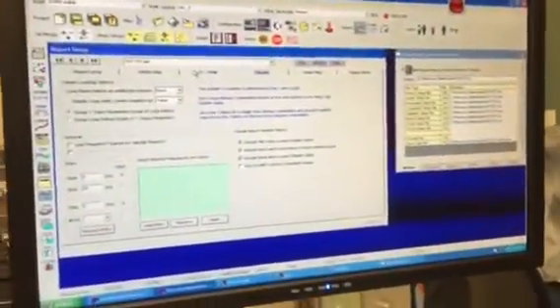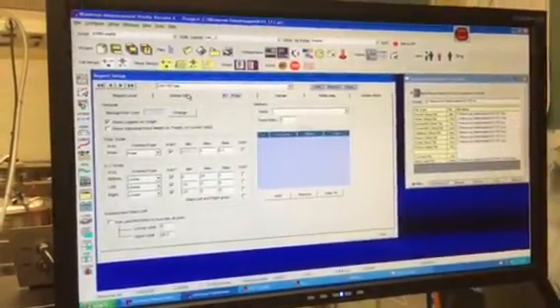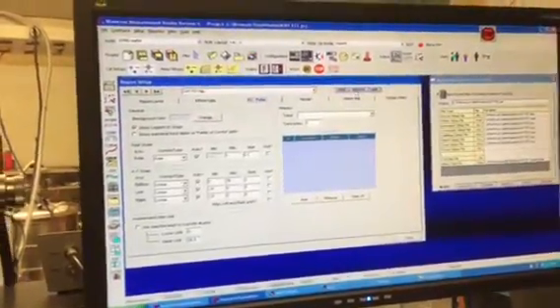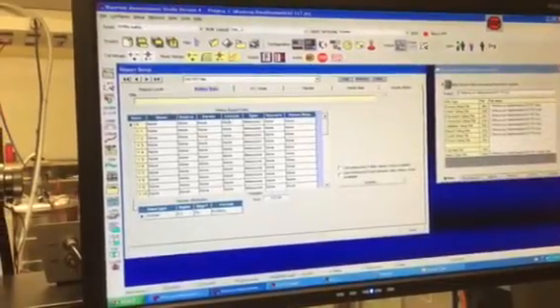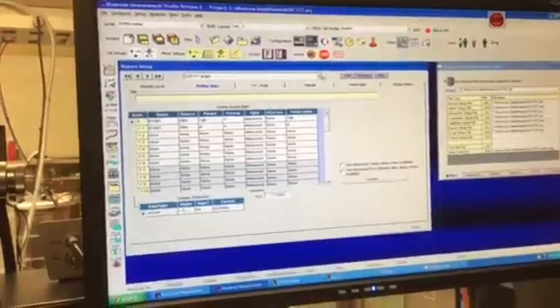Okay, so same on the tabular. Did you copy it from the previous one, or how did you go about doing it? No, I didn't copy. Okay, that's fine. So go back to define data then. Let's see what you put in for data. I might have missed it. Okay, so you have to start here by putting in your data, what it is you actually want in the report. So. I prefer copy.